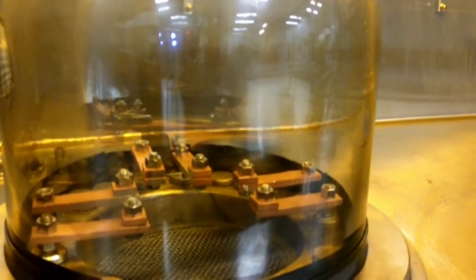We now evaporate with the right filament. I move the selector switch to the right, turn the filament power on, and again slowly increase the current.